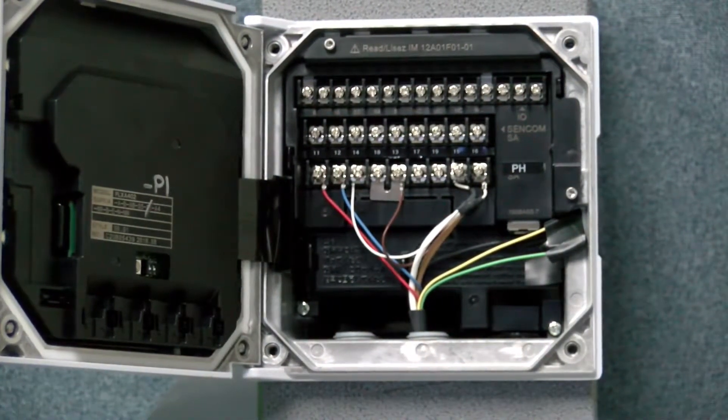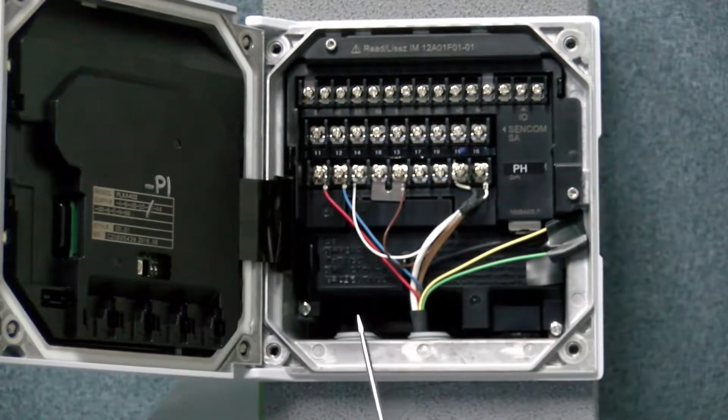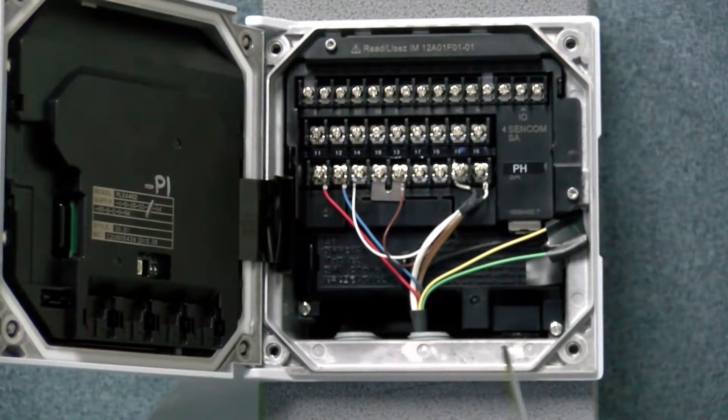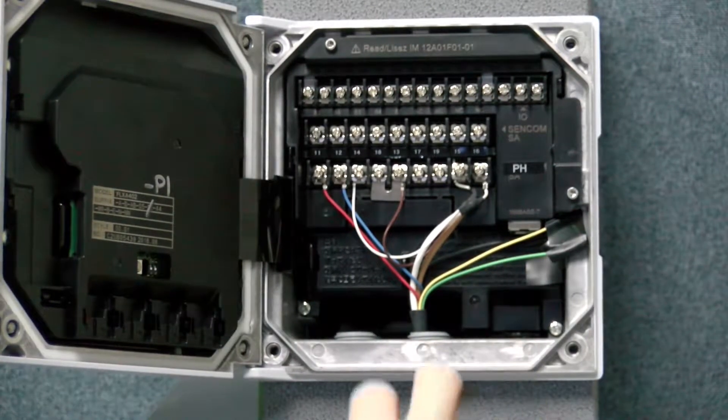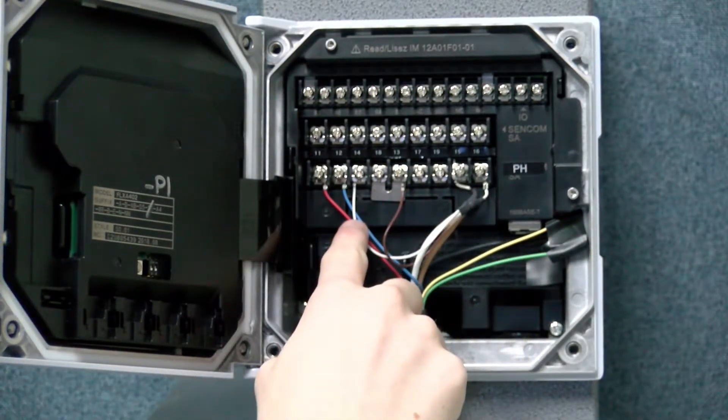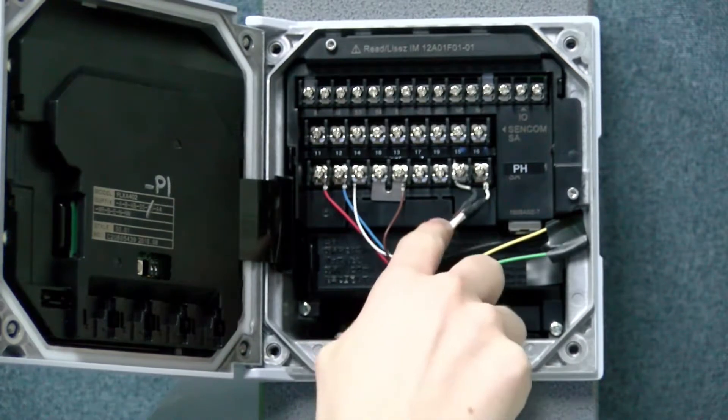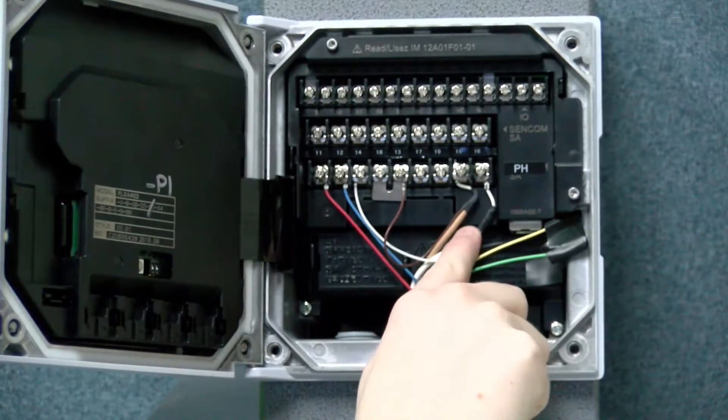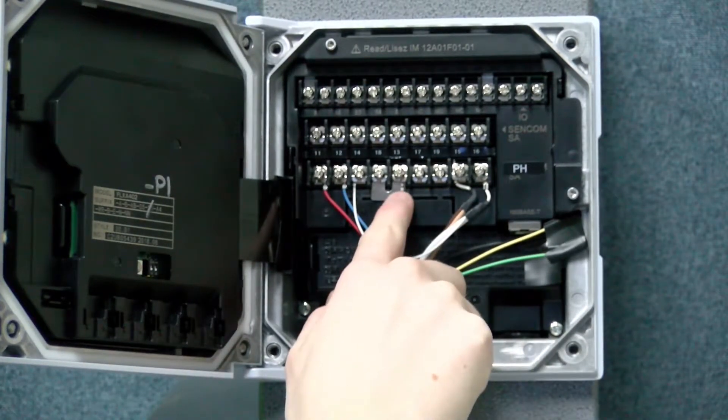So just a quick run through. You're going to have the red on 11, the blue on 12, and then the white wire, the large end on 16 and the smaller end on 14. And for the brown wire, you're going to have the large end on 15 and the smaller end on 13.